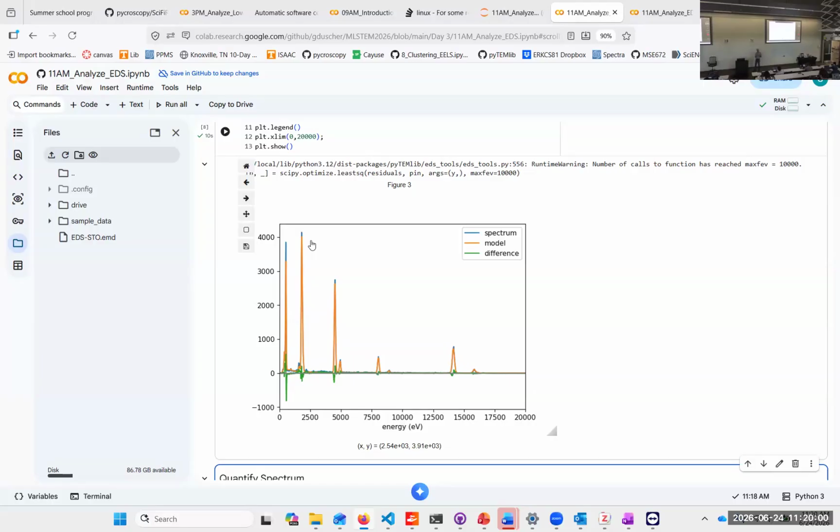Also, you have to watch very, very carefully in the program where it places exactly the background fitting for the background extrapolation. If there's a peak in there, then suddenly you have a background that goes up.